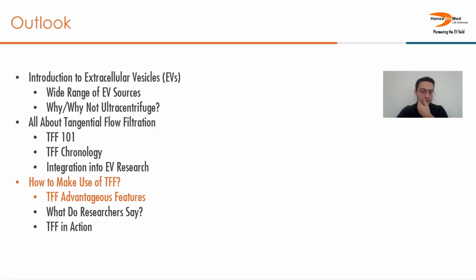So up until this point, we already covered what EVs are, why it is challenging to isolate EVs, and why we need alternative methods. And then we introduced TFF. So now it is time to answer why TFF can fill this unmet need in the field of EVs. So for this purpose, I would like to first start with the advantages of TFF.